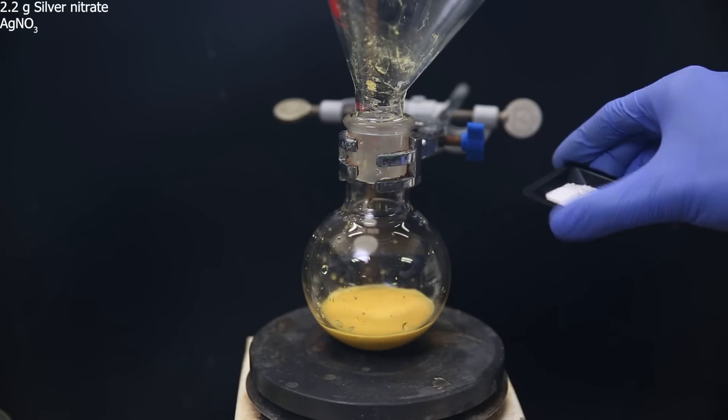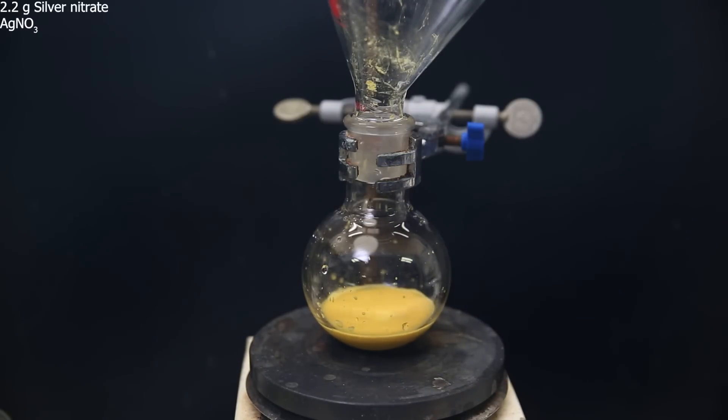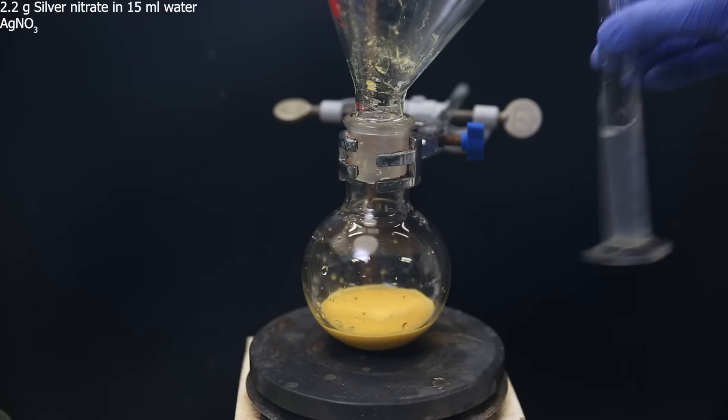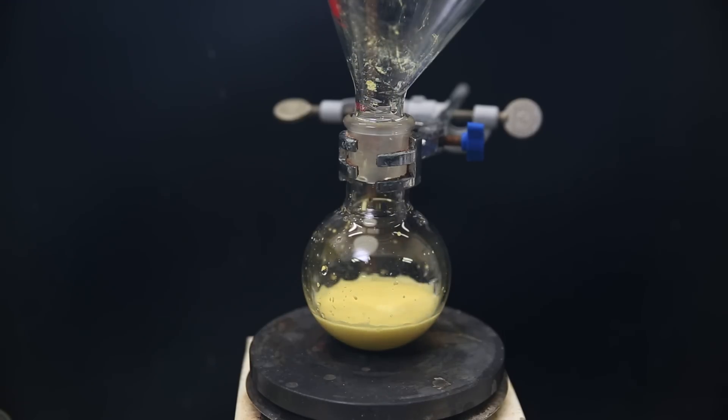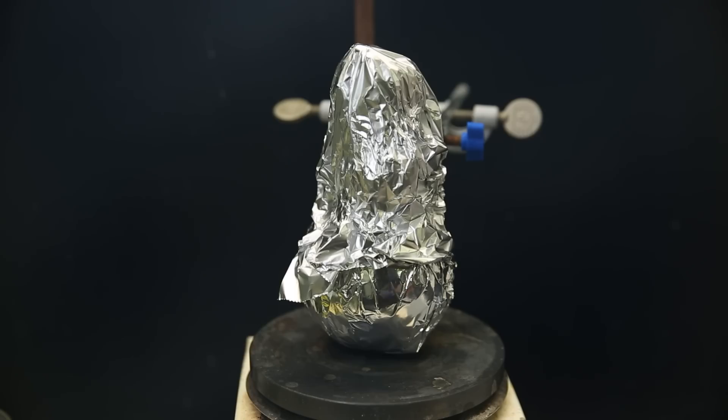Now for the next reaction, I have weighed out 2.2 grams of silver nitrate as the oxidizer and dissolved that in 15 mils of water. I add all of it to the flask, and it immediately turns yellow. I then stopper the flask and cover it in aluminum foil to protect it against light, because the silver nitrate is sensitive to light. I then leave it to stir overnight.